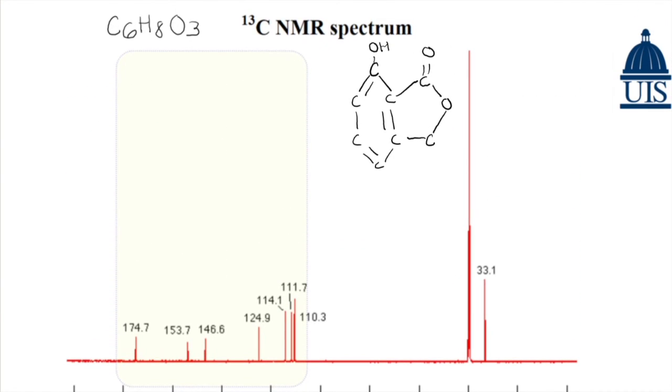So the only carbon that is left up here is this one here, and this one's just connected to carbons, which are only connected to hydrogens. So it's all the way closer to the right side of this graph.